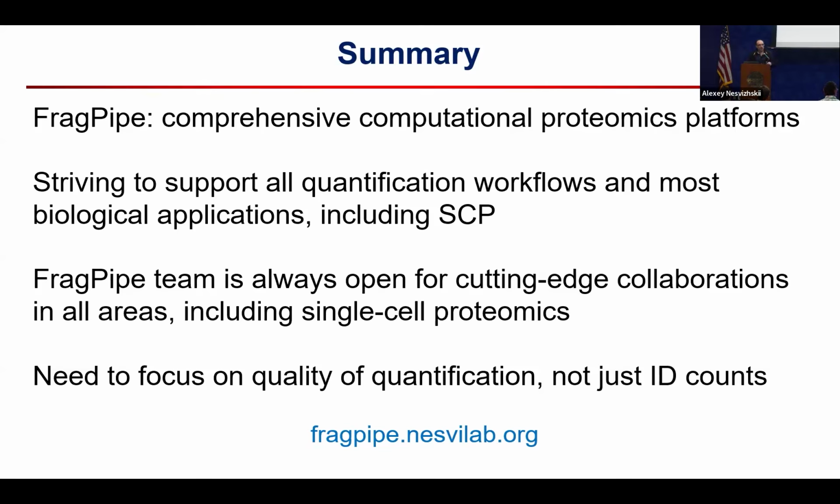So I guess what I'm trying to say here is that, once you quantify your fragments and peptides, what you do next is equally important. And that's a little bit of an underdeveloped area at the moment. There was an effort before and I think it will come back to looking at post quantification, the next steps for filtering out, finding the right fragments to use for peptide and protein level quantification up from the initial search.